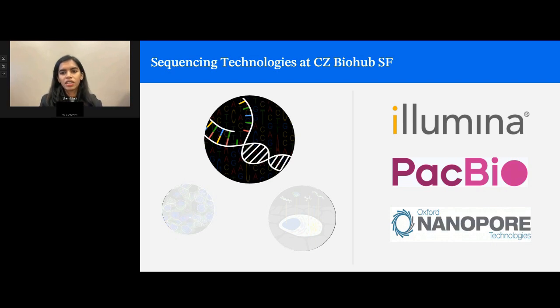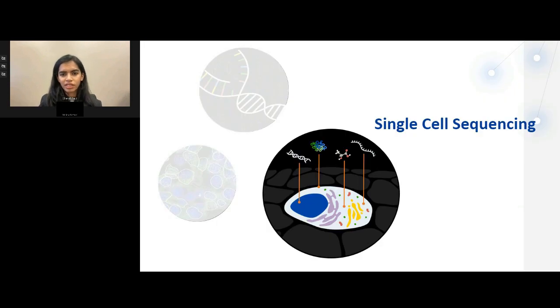So depending on the question that you want to ask and the throughput and the size that you need for analysis, you can either go with short read or long read sequencing. Finally, coming to single cell sequencing.